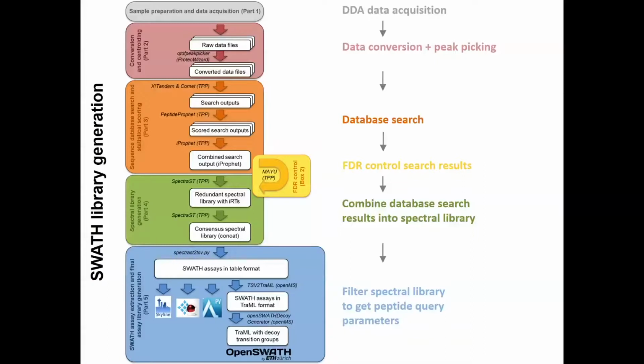But yeah, this is the goal, right? So the goal at the end of this workflow is going to be this set of query parameters. And just to mention, this is probably rather a complicated looking workflow, and this is the way we do things in our labs and also the way we're going to do it in the tutorial.